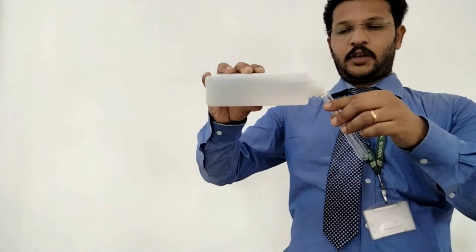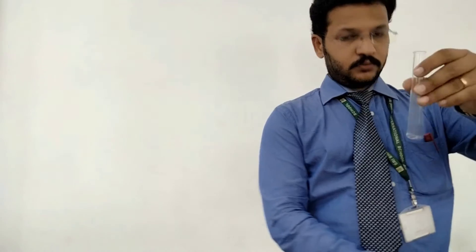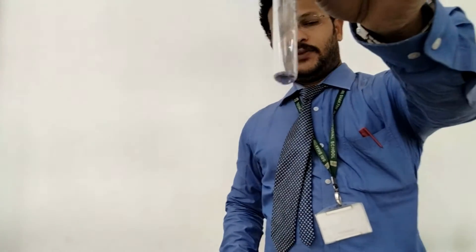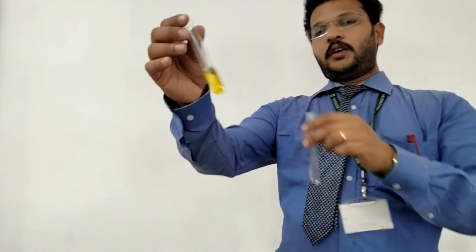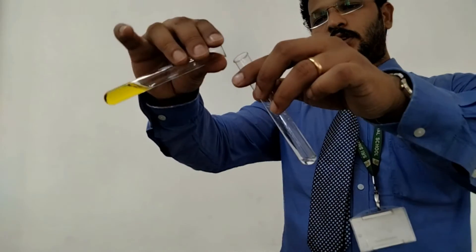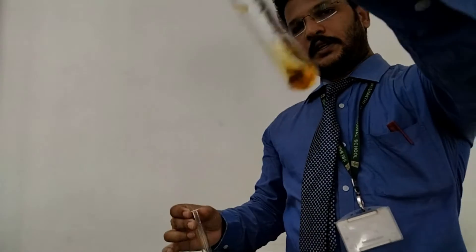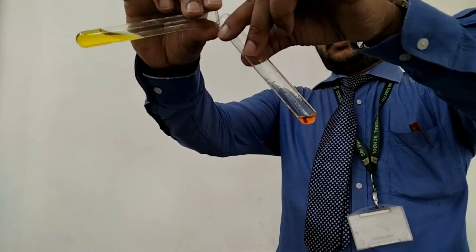Another chemical test for ethanol: taking a small amount of alcohol, to this I am going to add ceric ammonium nitrate. The color of ceric ammonium nitrate is yellow in color. When I am adding this to alcohol, it will turn wine red color.